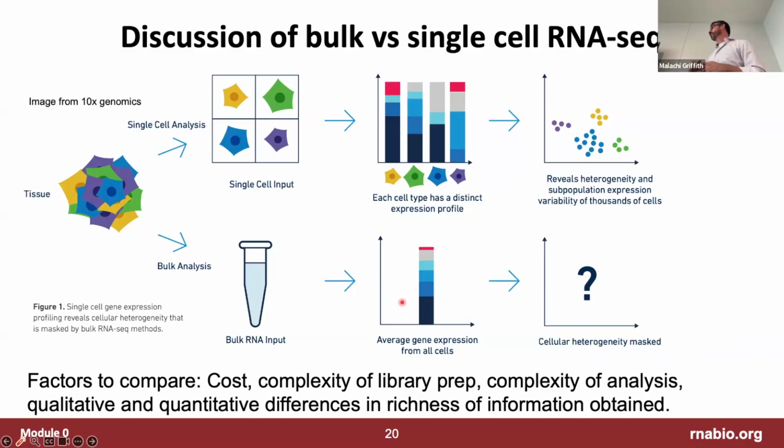So you're introducing bias or maybe causing RNA quality issues because it takes so long to do that. So the beauty of single cell is you just take all your single cells and you feed them into this box that creates all these individual droplets, and you're able to get a transcriptome readout for each of those individual cells. You can then put them in piles and say, okay, here's my rare stem cell population, and now I'm getting this amazing cell by cell readout of what's going on in those cells. So that's the upside.